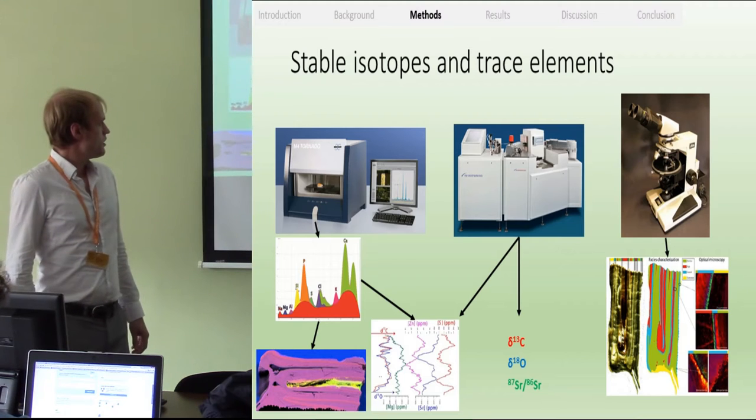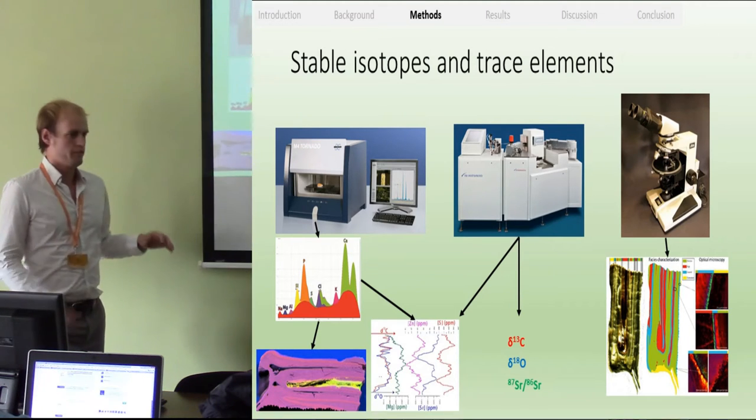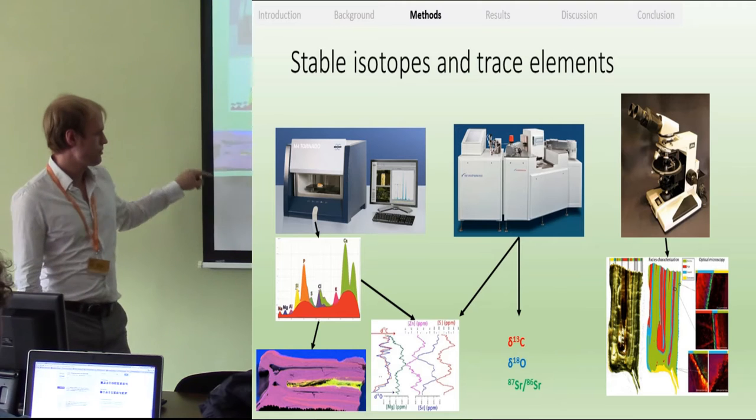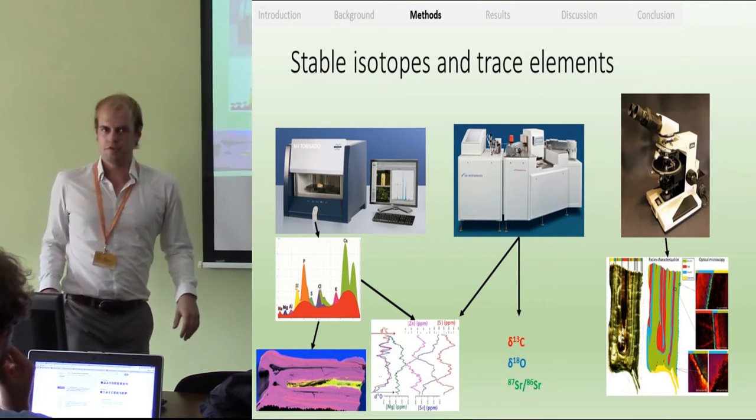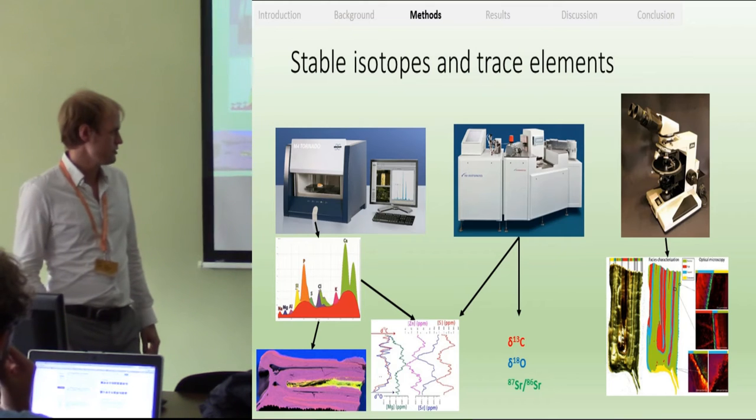It's very nice. If you put in different settings, you can also map a section of the tooth, for example, and identify different phases within the tooth or within any other sample that you'd like to measure.